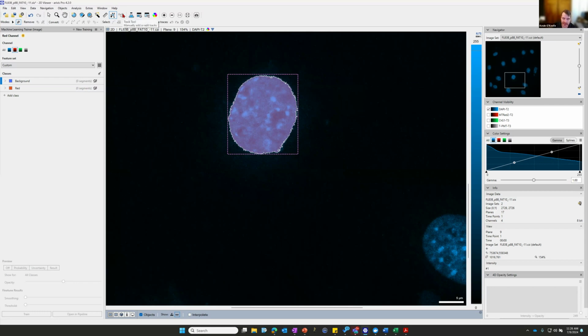If you do any tracking of objects, so I mentioned before, there's some people who've done a tumor cell T cell assay. I know that's pretty common. If you want to track those T cells, you would then get it into a lineage. So it's object 1, time point 1 is here, time point 2, and it'll have a little line connecting these. And then if you have these objects that split, you'll then see a node with them splitting into now 2 different objects. So you can track a lineage. And same thing, if you need to change the tracks, you can just drag and drop them to the correct track if needed.